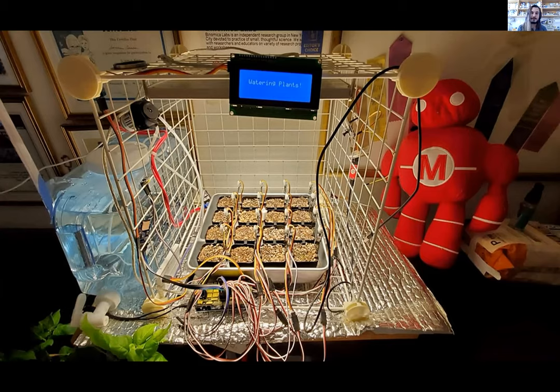Where on day 15 you hand pollinate, and on day 30 or 40, depending on your humidity, you harvest your seeds. So with one water tank and a press of one button, it will grow to seed these plants. And you can put this into a mini fridge and have a thermostat and actually have a really decent plant growth chamber with no soldering and a bunch of stuff off of Amazon, or if you want it even cheaper, stuff off Alibaba. Here's some data from it.